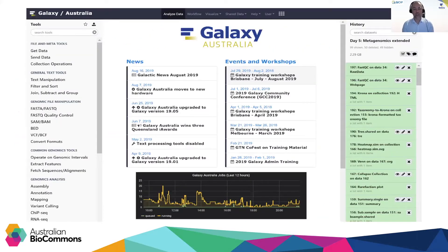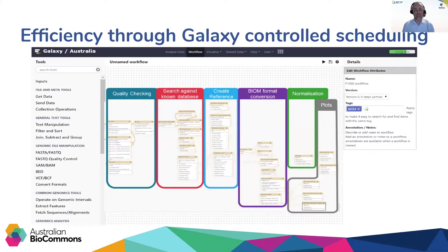Looking at what Galaxy actually looks like: it's a web interface with approximately a thousand different tools on the left-hand side, with text-based contextual searching to help narrow them down. Tools are grouped into functional categories based on research such as ChIP-seq, RNA-seq and variant calling. The right-hand side contains a completed history — in this case for metagenomics analysis of a complex fecal sample. The middle of the screen is interactive between news, events, tools and data.